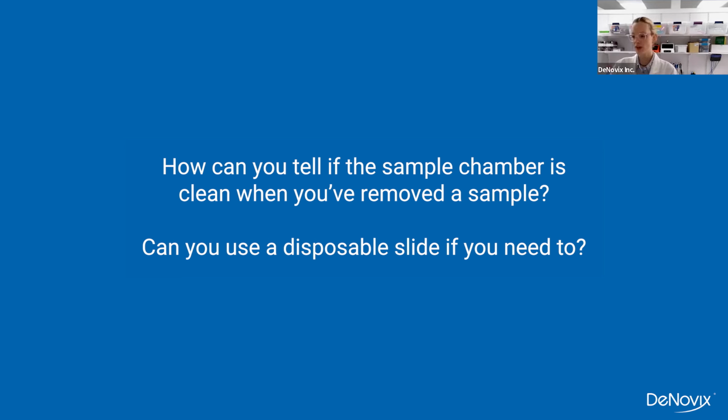Great, thanks. Somebody was asking whether you have a minimum and a maximum size of organoid that the machine learning algorithm can effectively recognize. So our dynamic range of organoid size would be 4 to 400 microns. And you also have the ability to gate out certain diameters with your results. Okay, great.